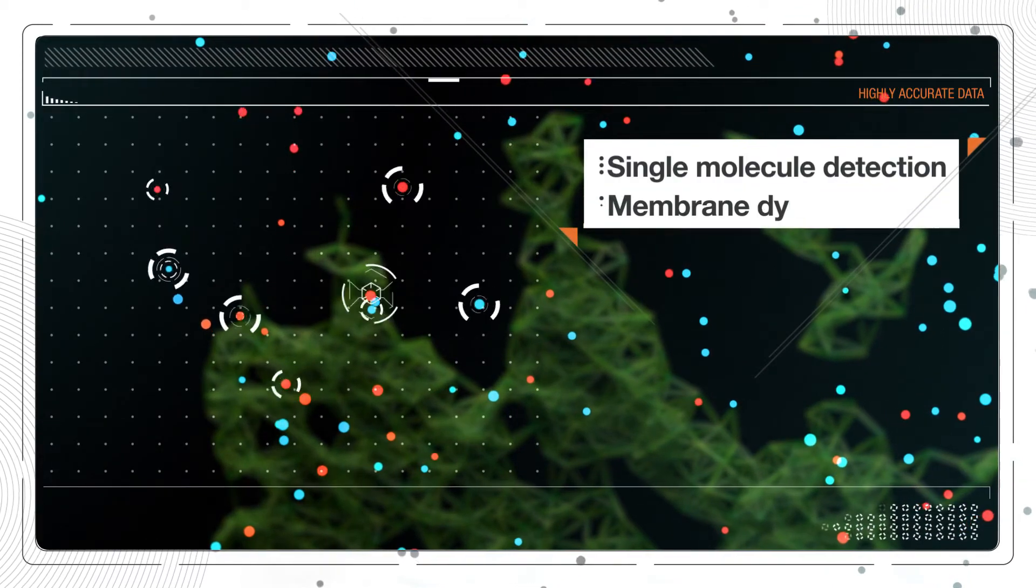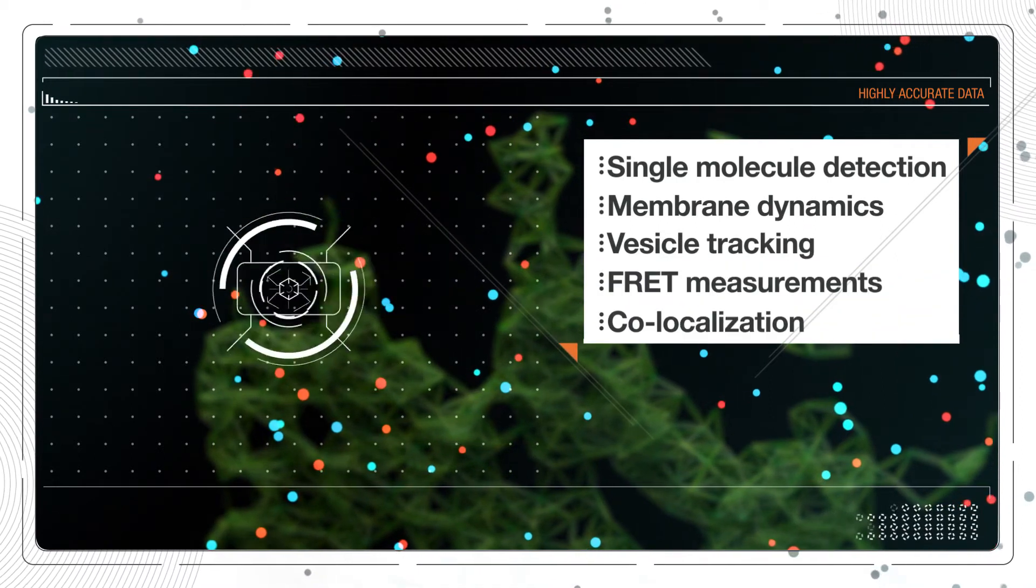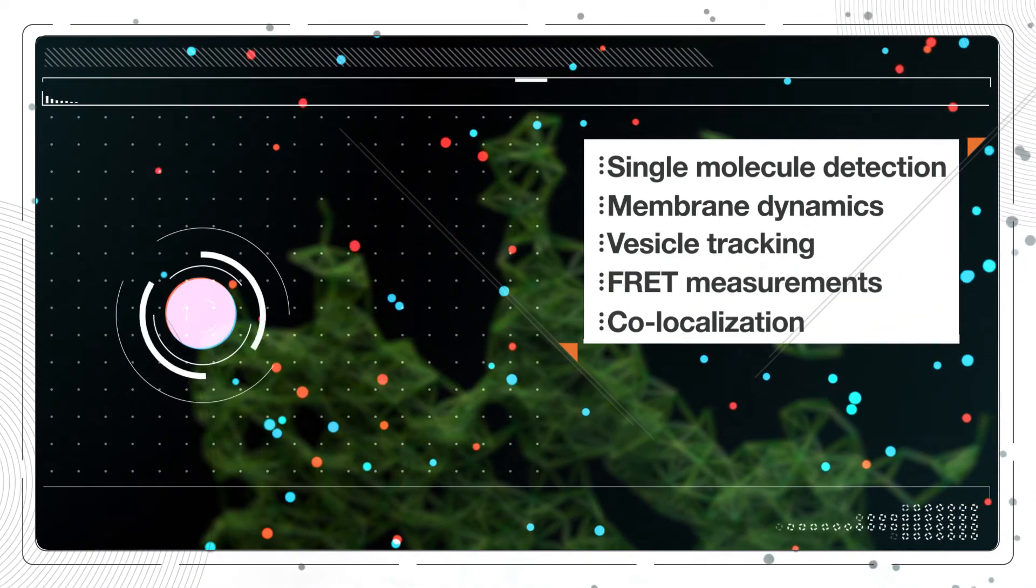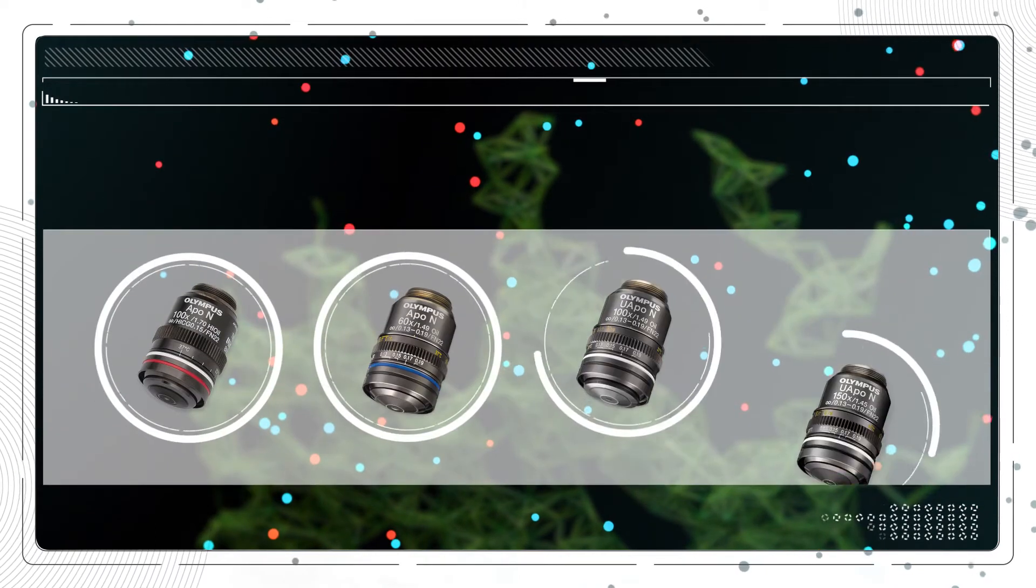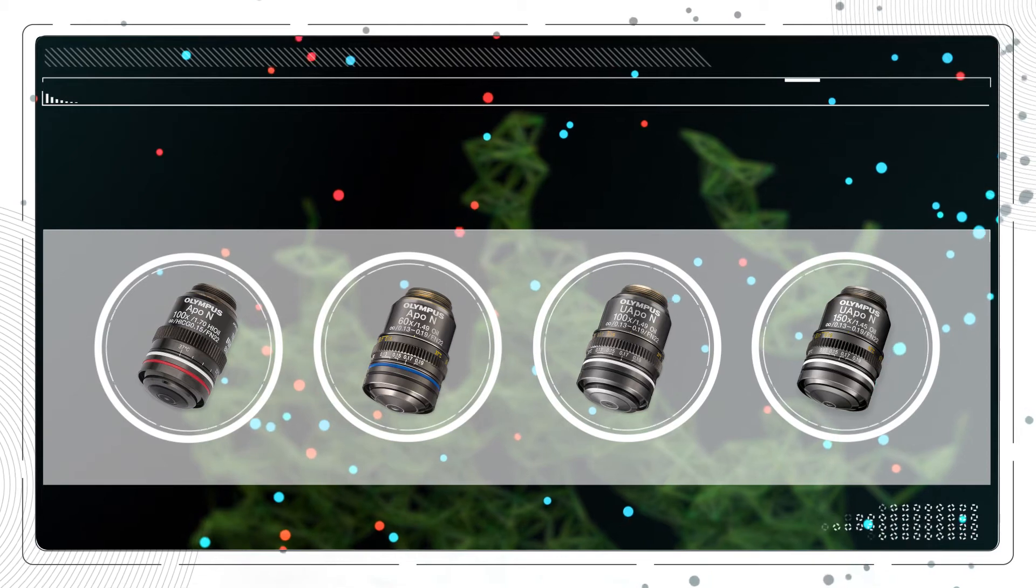This new level of sensitivity and precision delivers highly accurate and comparable data from all your studies. You further benefit from a broad range of high-performance objectives tailored for your research field.